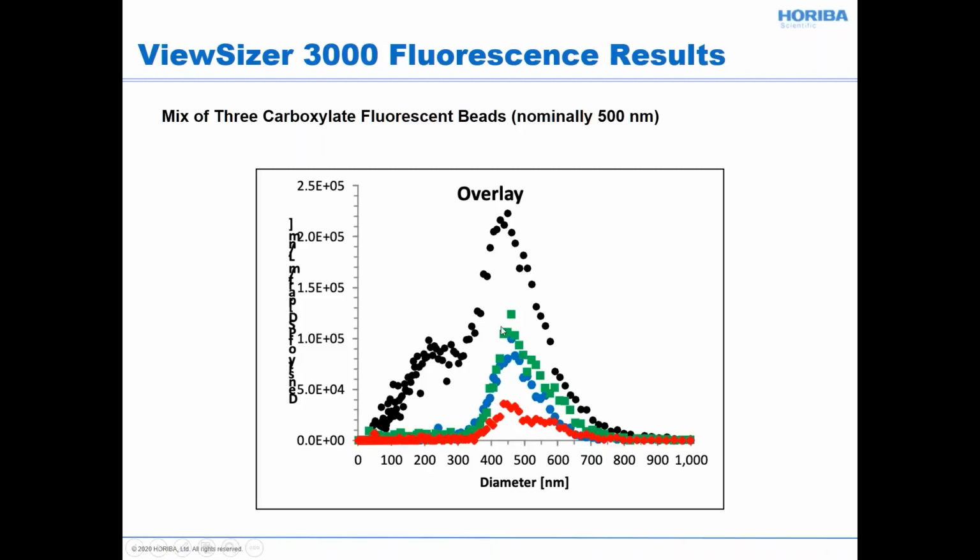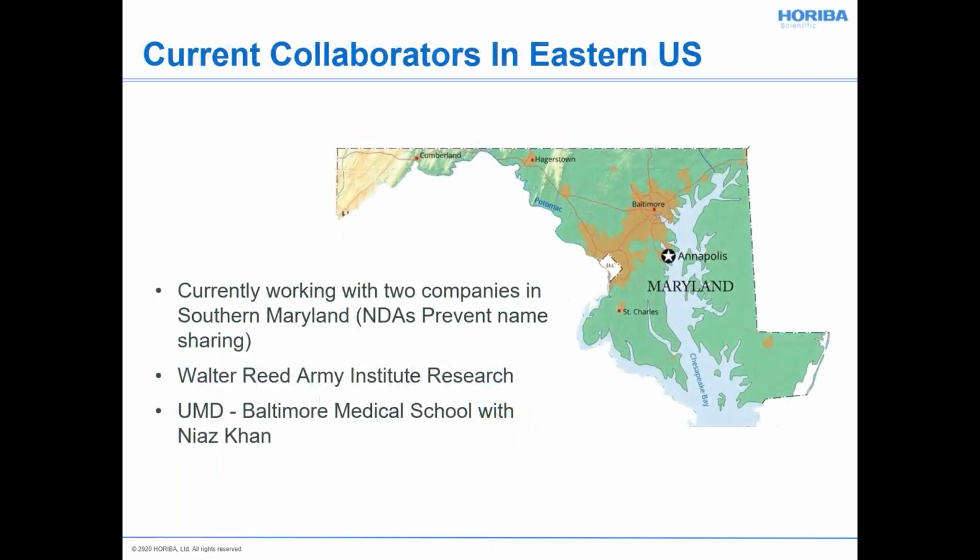And we can recover that by adding up the green and the blue and the red. And we don't observe any of the 200 nanometer impurities. And so with this fluorescence and appropriate tagging, you can really separate out which species you have in your sample.